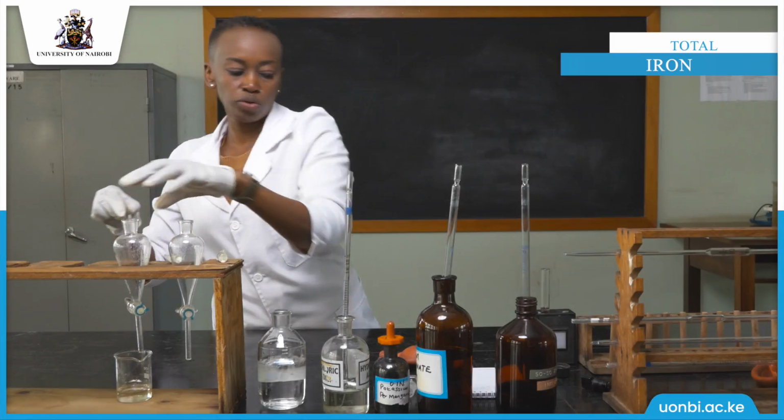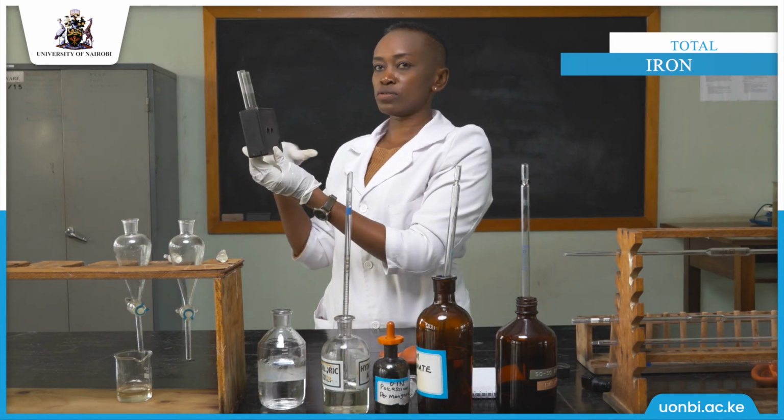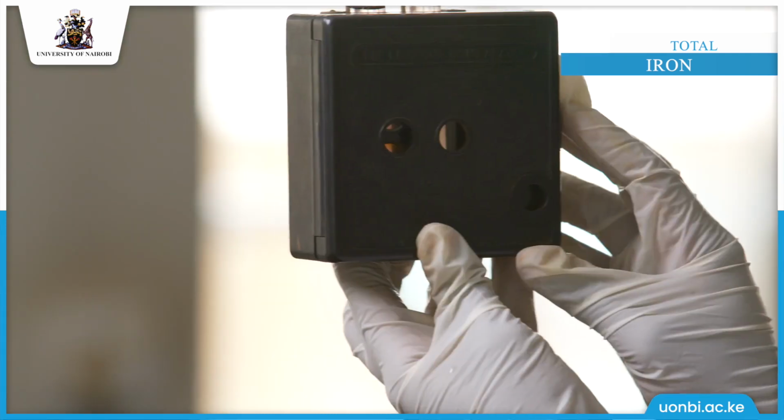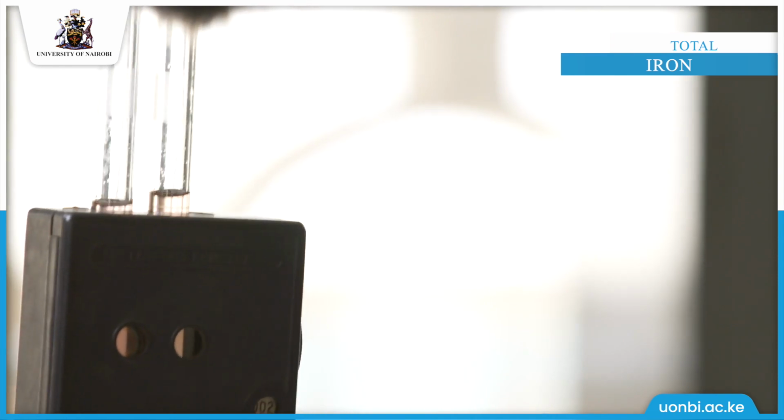The distilled water, we put it on the left-hand side compartment. Then from a source of light, we are supposed to rotate the disc. And where the 2 circles match, we take that reading.